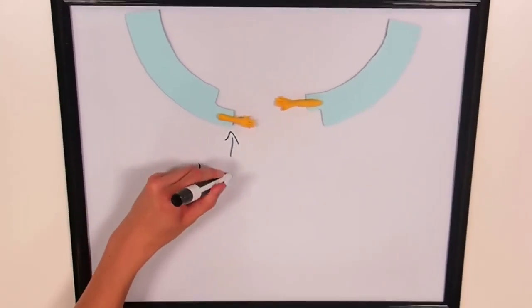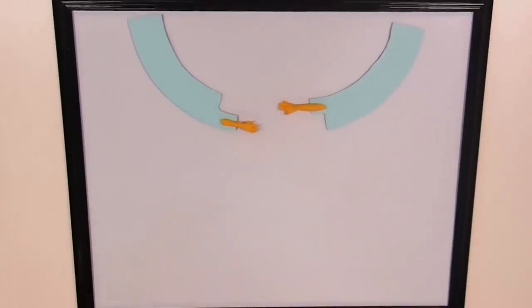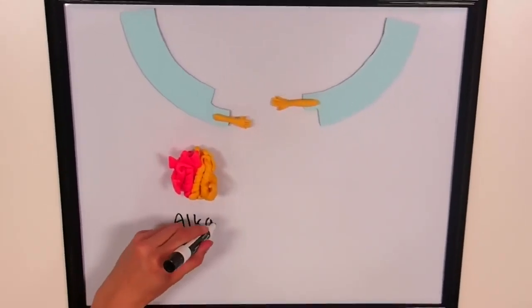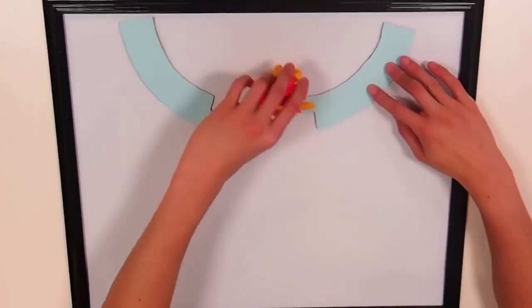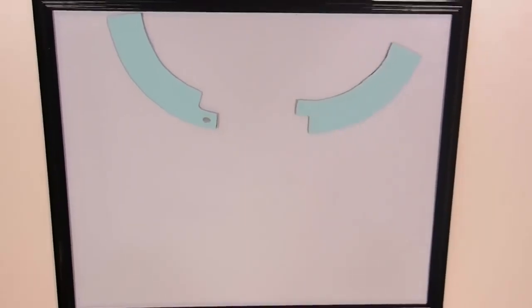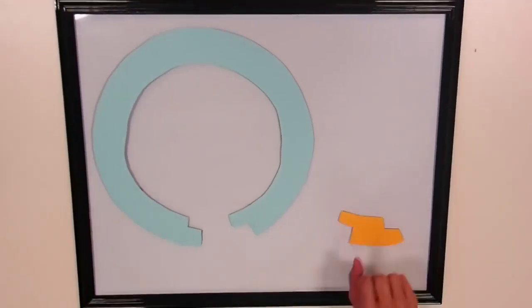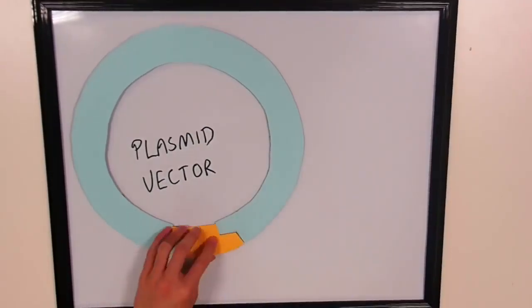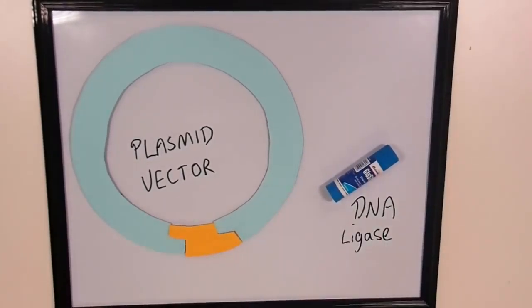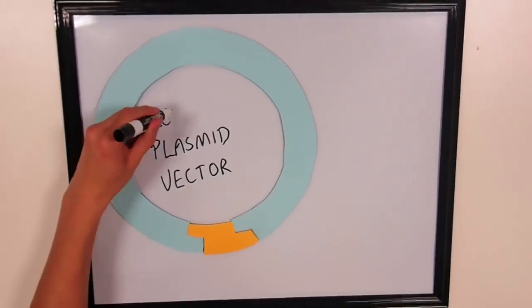Before ligation, the sticky-ended fragments must be prepared to prevent self-annealing. This is done through the use of alkaline phosphatases that dephosphorylate the plasmid ends. If the action of your restriction enzyme has produced compatible sticky ends, then you can proceed with ligation of the fragment into your target vector.